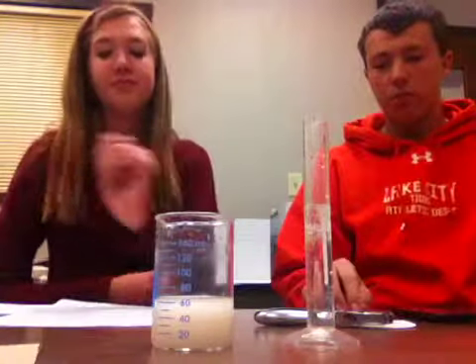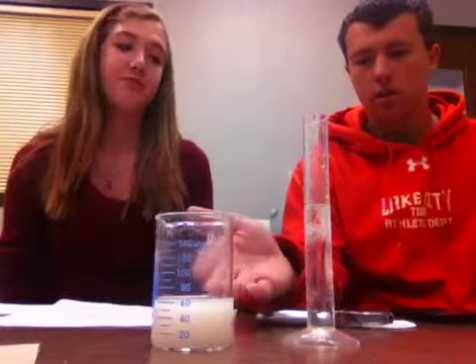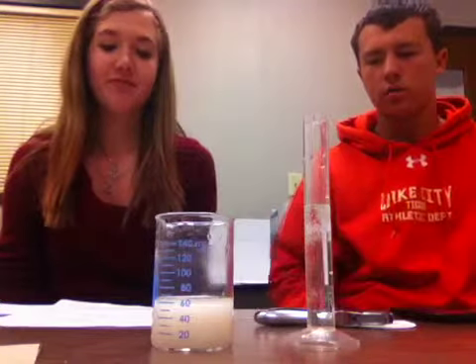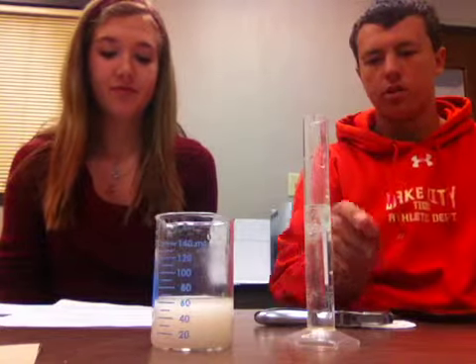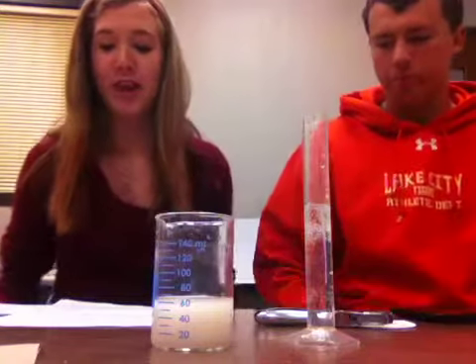So in this lab, we have a beaker of yeast with 20 milliliters of water added and a graduated cylinder of 20 milliliters of hydrogen peroxide. Yeah, this is our last trial. We've been adding 5 milliliters of water each trial.